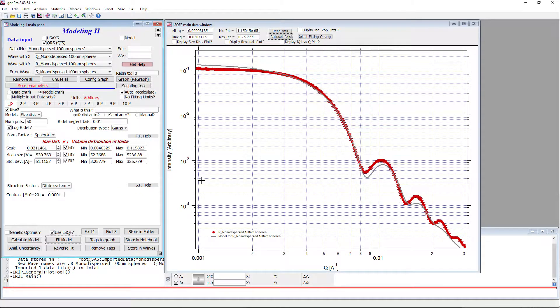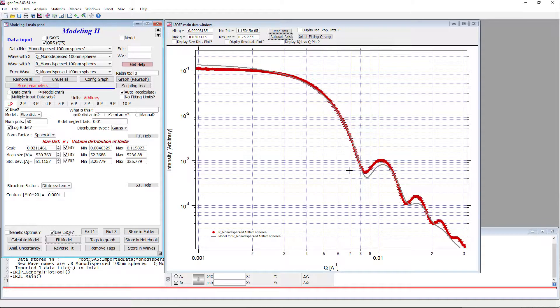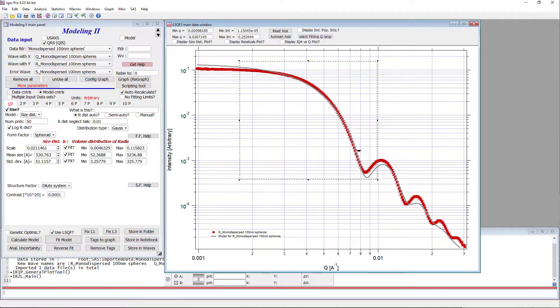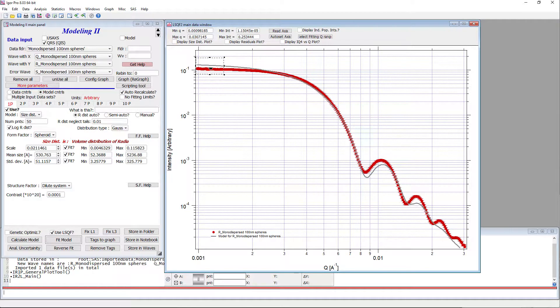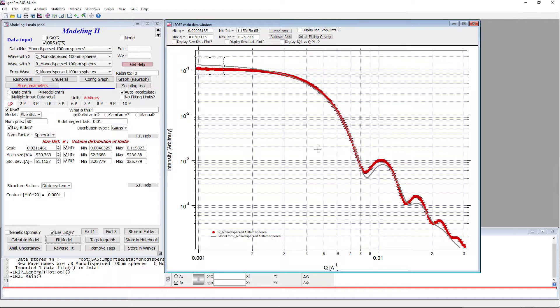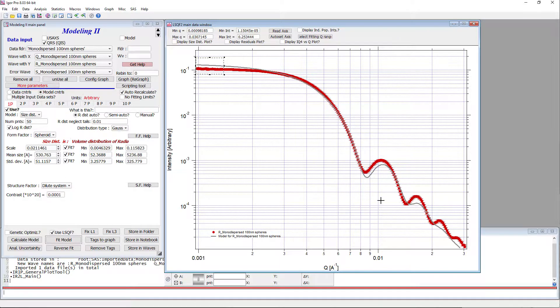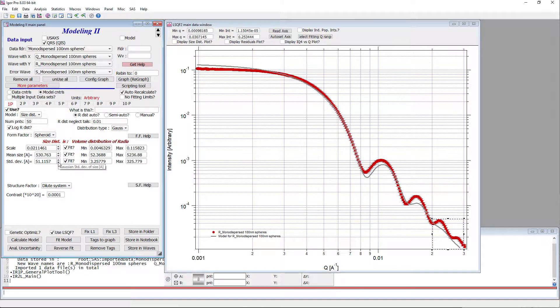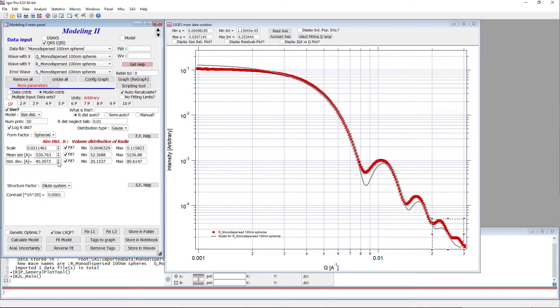First, that just shifts everything a little bit. And then I would add the width. I start usually with just a few important parameters and then add the less important parameters. And we do a fit. So now what you can see is that we're fighting with the system here. Clearly we are not having success because if we want to fit this part of the curve here at lower Q's, the first Guinier, we are not fitting the high Q here. There's a misfit at low Q here, which you can see the intensity is actually below what the dilute limit model would be here.